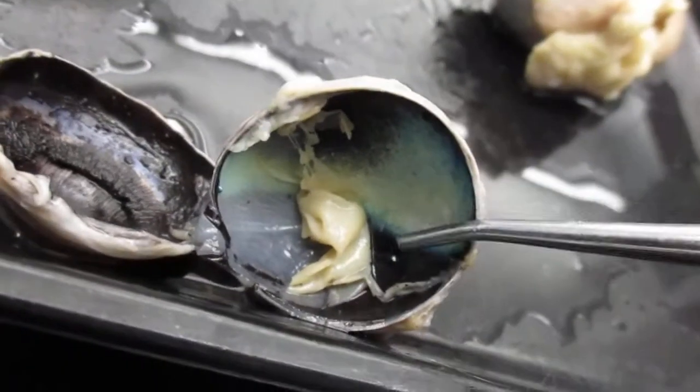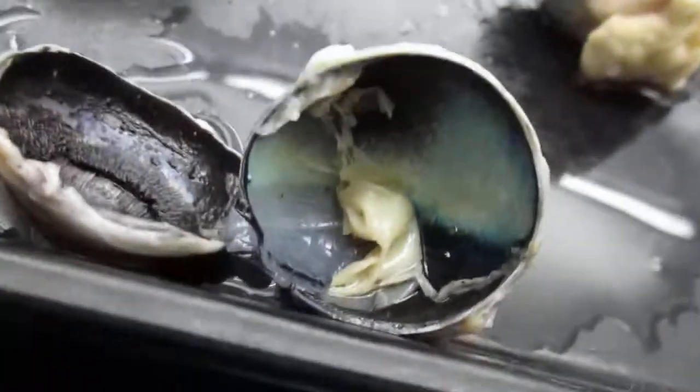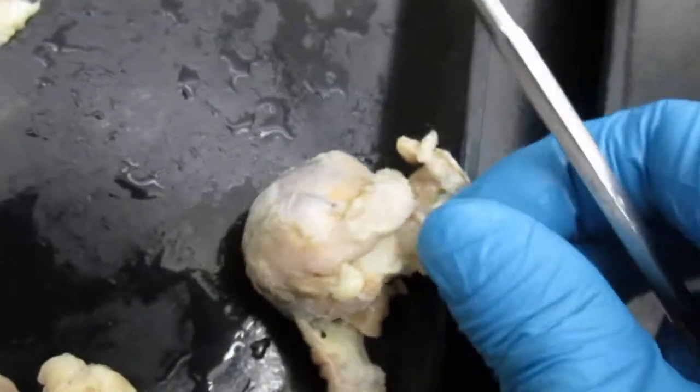Now, I think I got it exposed a little bit. Now this clear, shiny green stuff, that's the tapetum lucidum. That's the tapetum lucidum. Okay? And on this eye right here, this is a good specimen.